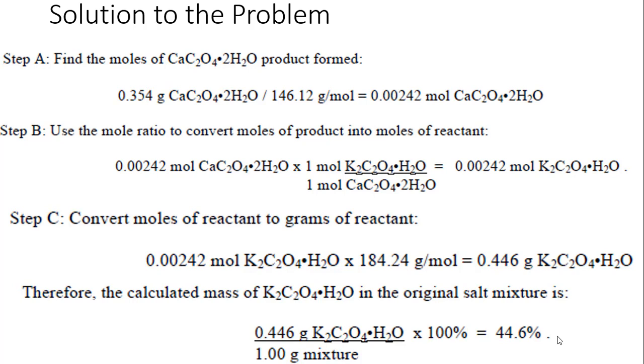All right, so once we go through tomorrow, right, the main thing I want you to know is that we're going to have to do that digestion step, and we're going to have to do a filtration. So I need you to read the lab manual, make sure you come prepared, bring your goggles, because we're going to be using hot plates, and you cannot work with any of this stuff without your safety equipment.